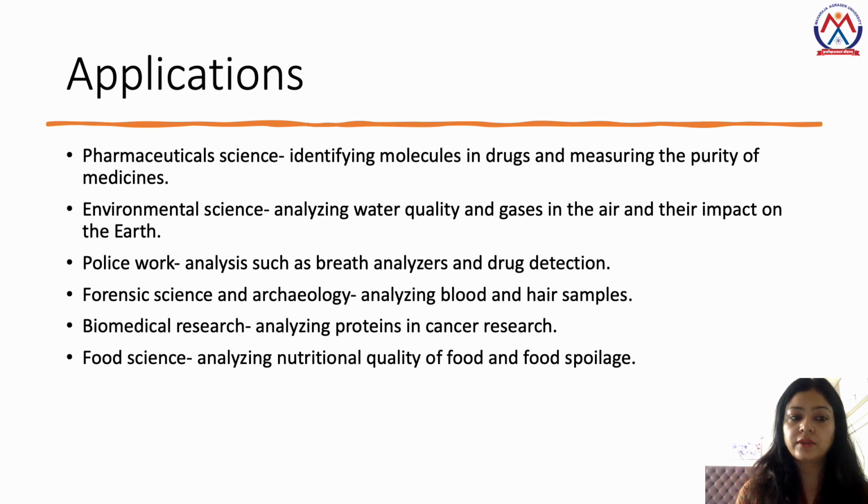Applications of chromatography. There are various applications in different fields. In case of pharmaceutical science, chromatography is used to identify molecules in drugs and measuring the purity of medicines. In environmental science, it is used to analyze water quality and gases in the air and their impact on the earth. In police work, it is also used to analyze various things such as breath analyzers and in drug detection.